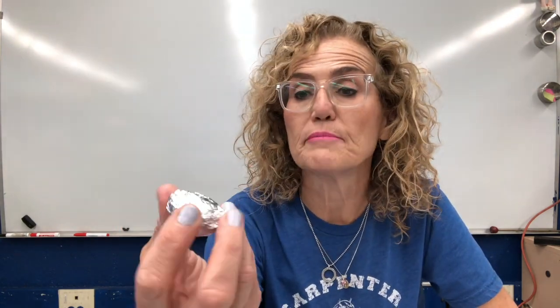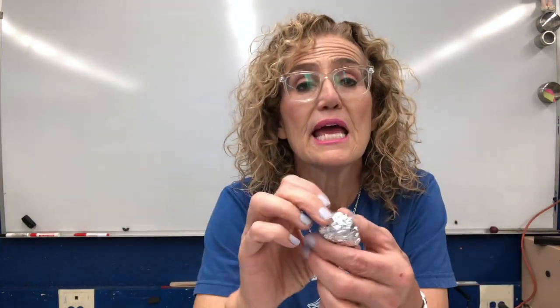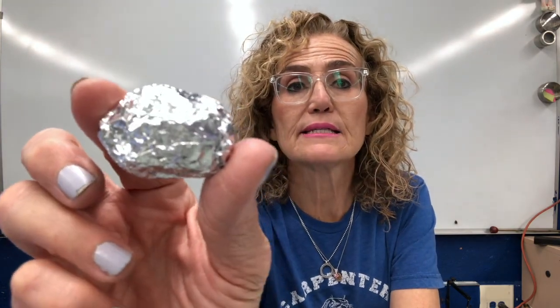Number 3, the size of your pellet. If you have a measuring tape or a ruler, you can measure it, but you don't have to be precise. Is it 10 feet or is it 1 to 2 inches? That's kind of what I'm looking at. So mine, I'd say, is 1.5 inches.